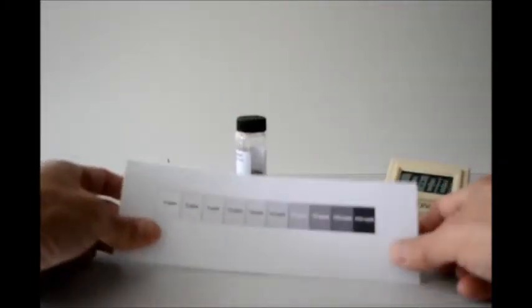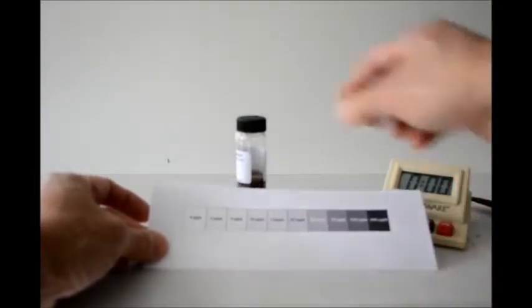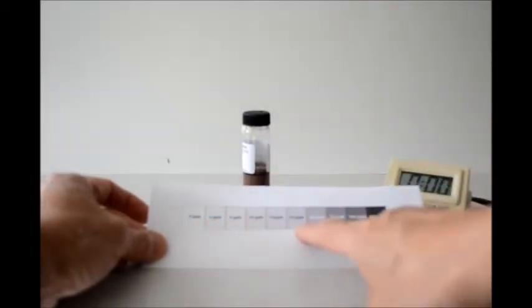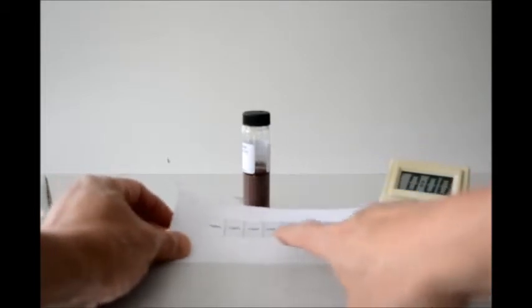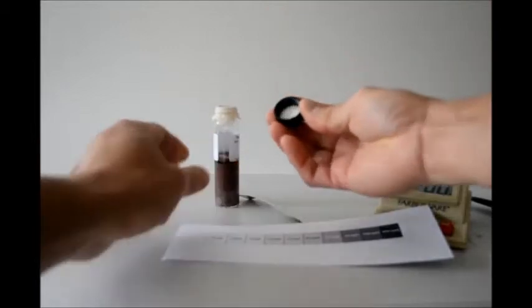I have here a chart to see if there is any arsenic present in the sample — the color will tell us how much arsenic there is. I'm going to unscrew the cap and take a look.